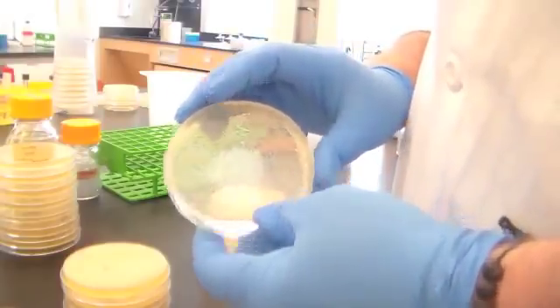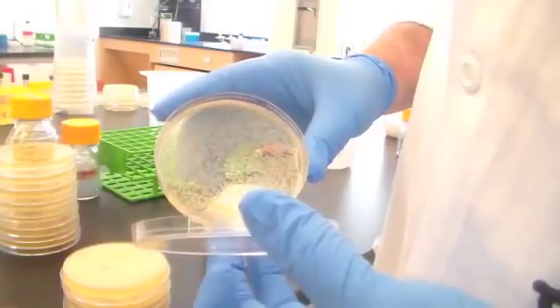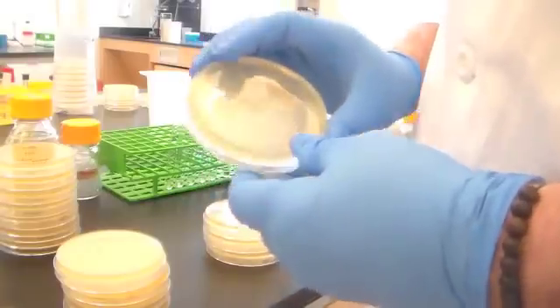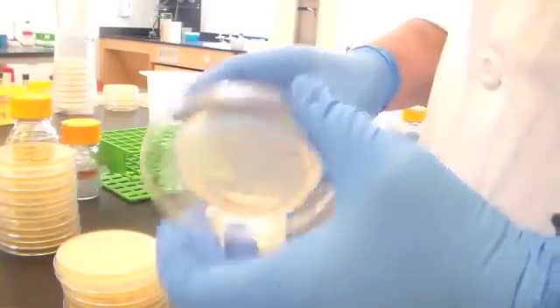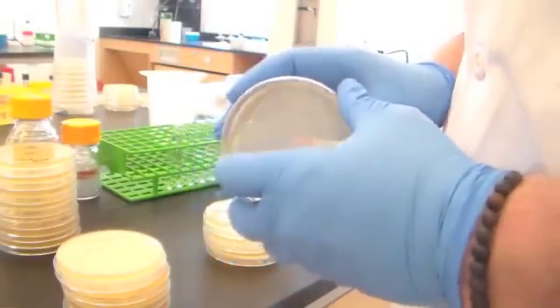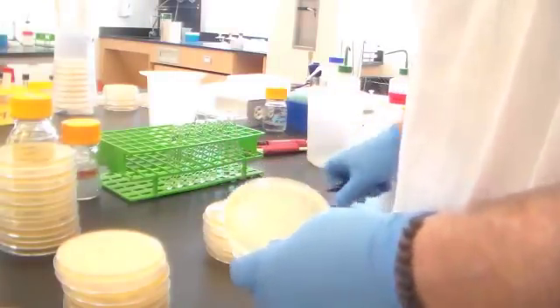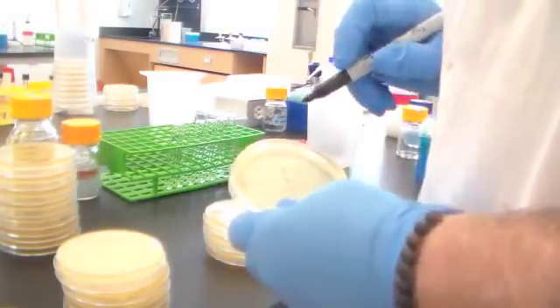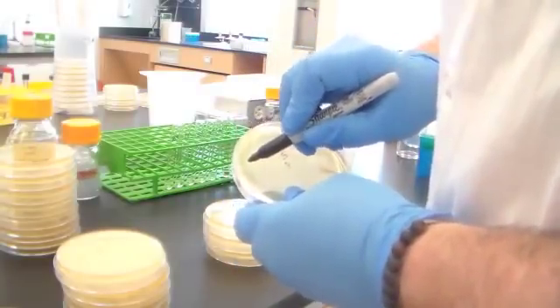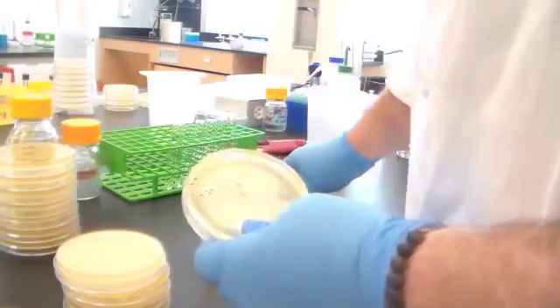Once we get out to 10 to the minus 4, now you can see individual colonies, but still, I wouldn't even make the TAs count that number of bacteria. At 10 to the minus 5, now we're getting someplace. Here, you could reasonably count the bacteria on that plate, and probably should. To make counting easy, and to make sure that you don't count the same colony twice, you're going to take a Sharpie, and as you count them, go 1, 2, 3, 4, 5, 6, 7, 8, and count an entire plate.